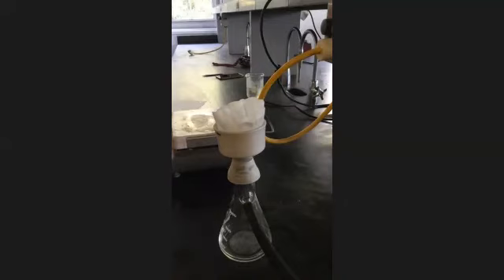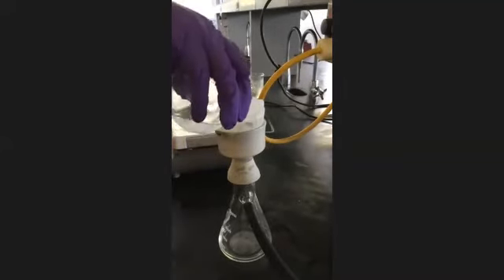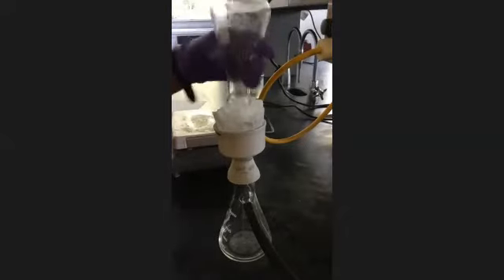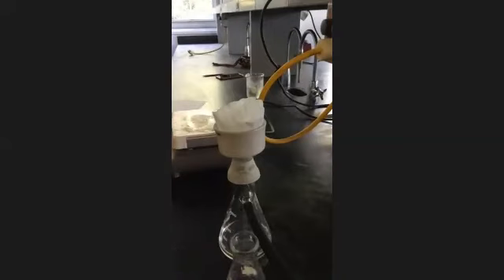Here you go, Larry. I'm going to just give you 40, so you don't have to keep coming back. Yeah, you're going to rinse it with this. No tap water. That's what this is for. You're going to add 20, swirl it, pour it, and then add the other 20, swirling and pouring.